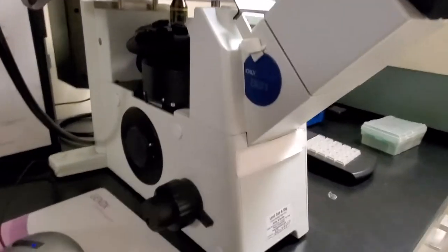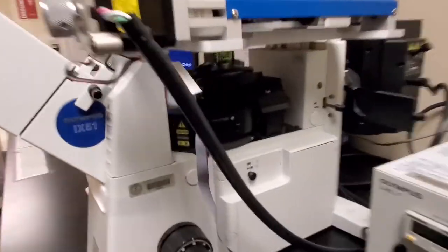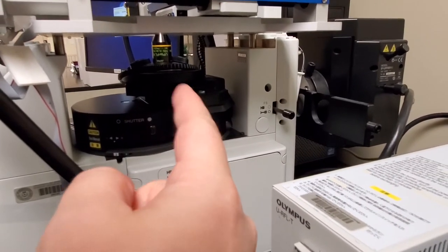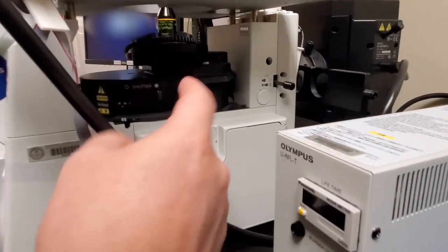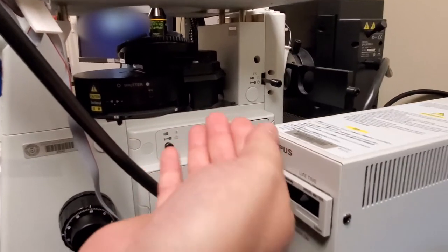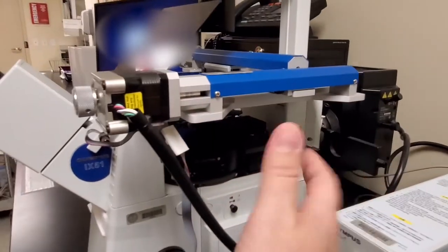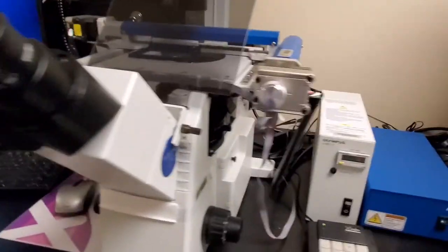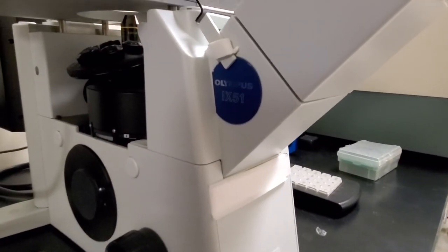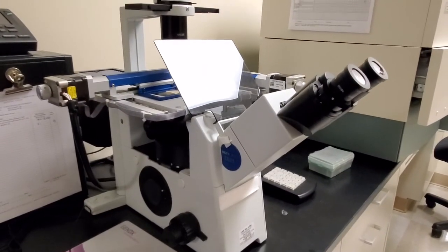Very special microscope. You guys probably won't see one of these very often, but if you do come into it, what makes it very special is this guy right here, which is mounted right beneath your objective. And that's your phase converter, I guess is what they would call it. But I can't even pretend to know all the options on this guy because they're so special, you don't see them very often. I just figured I'd show that to you guys since you're probably not going to see them very often. That's the Olympus IX51. A very special microscope.